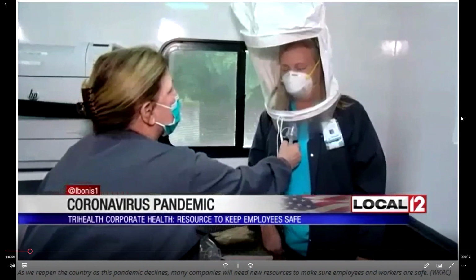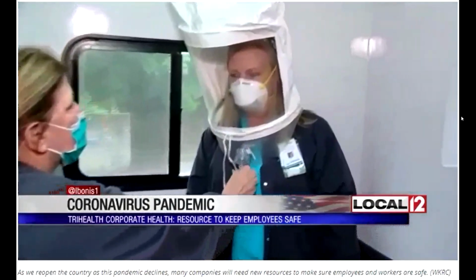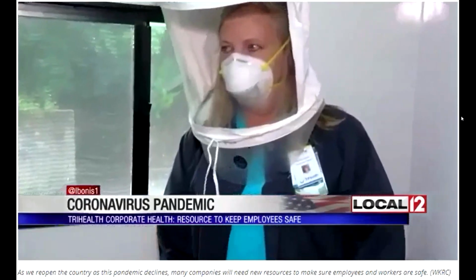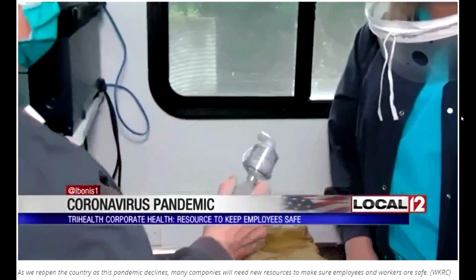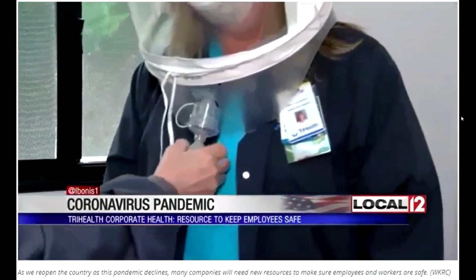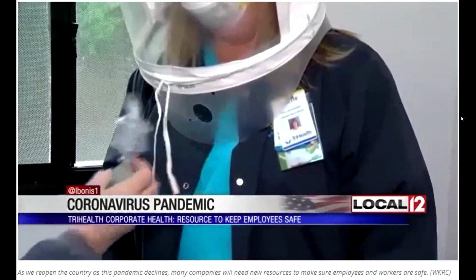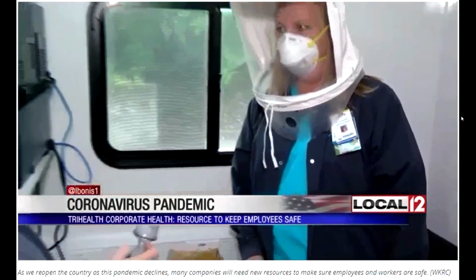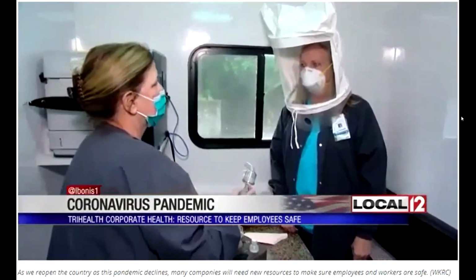Some of that testing the team here demonstrated. What they're demonstrating is a fit test. So N95 respirators are required by certain individuals in a respiratory protection program. But to do that, you need to be tested for the make and model of the respirator. So Carol is actually conducting the test to ensure that there's a good seal or fit for Jeanette, who is being tested for that.